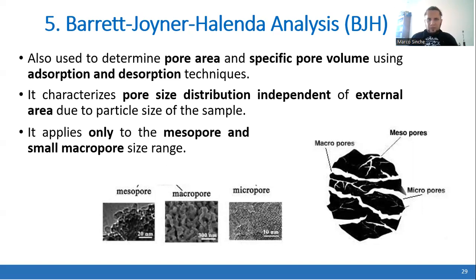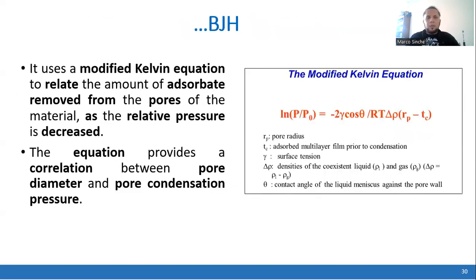This analysis applies only to mesopores and small macropores, size ranges which go from a few nanometers to around 300 nanometers, as can be seen in the image.